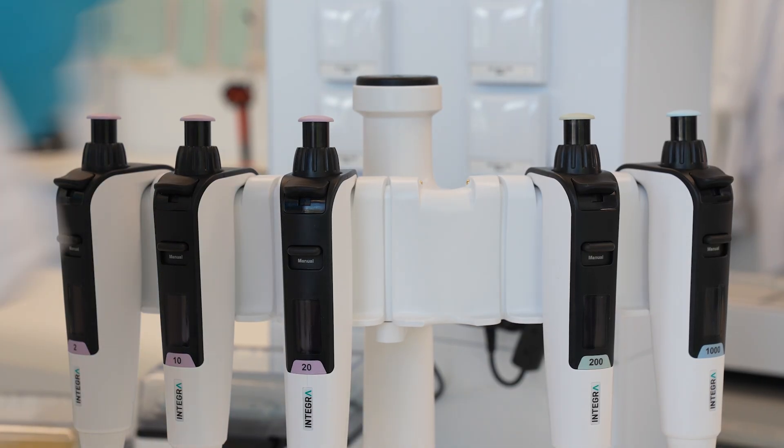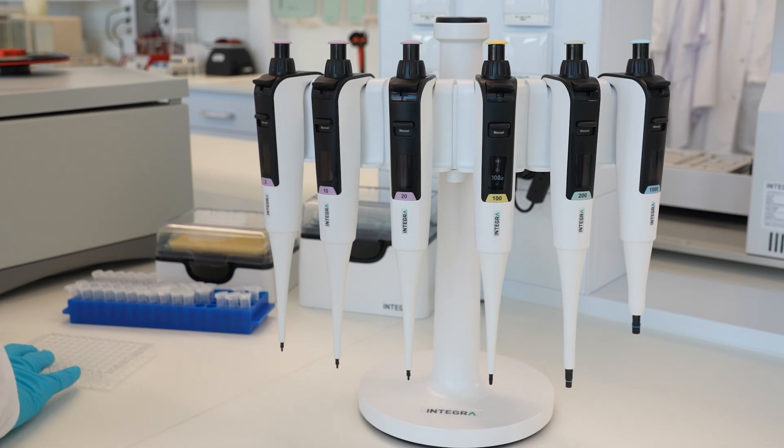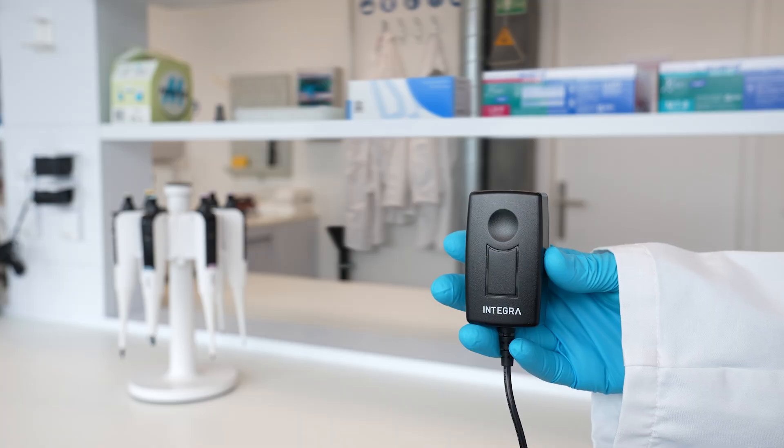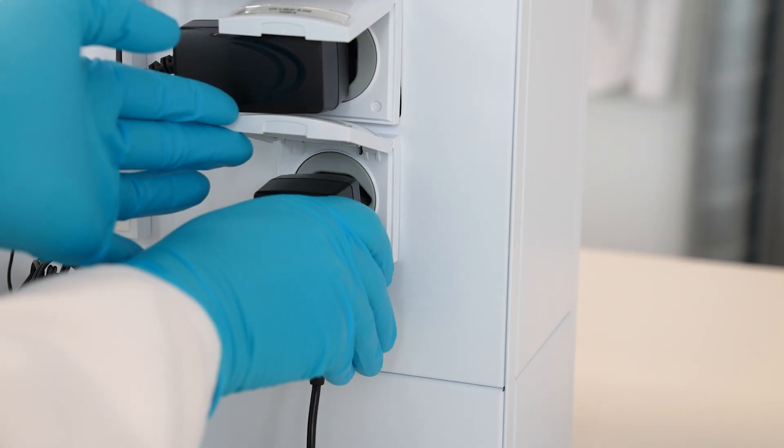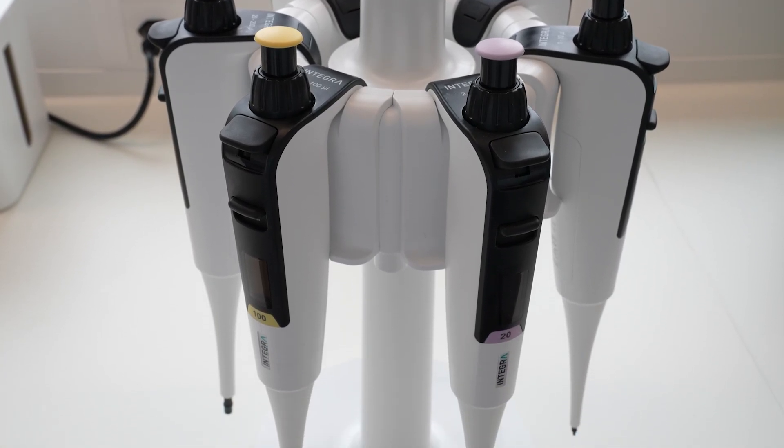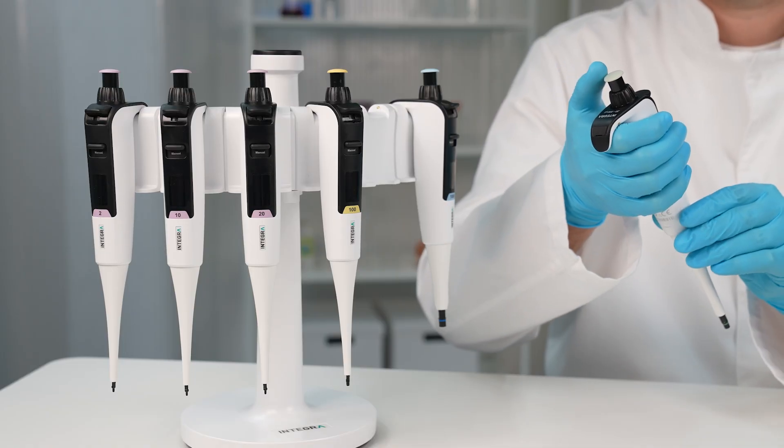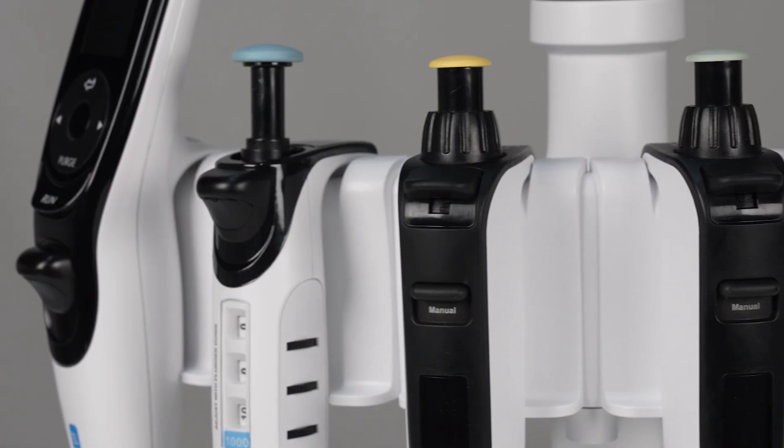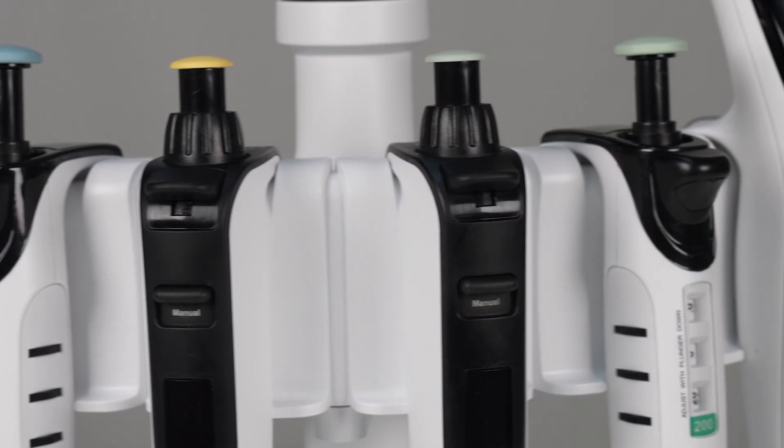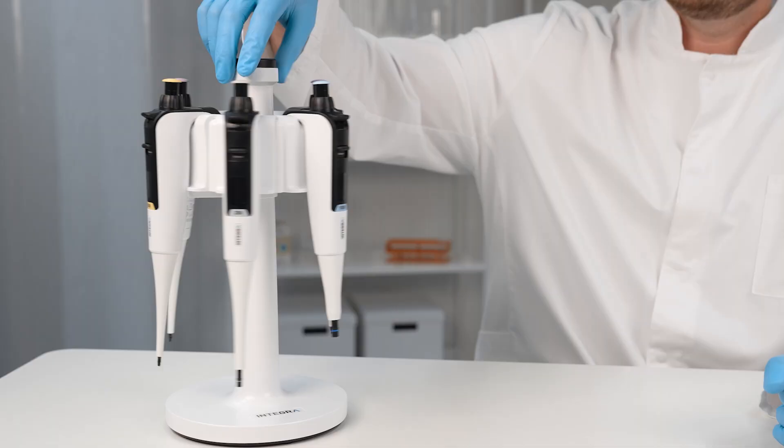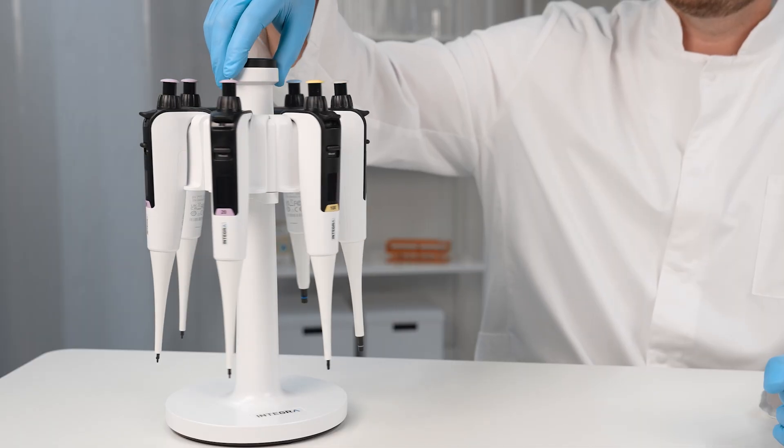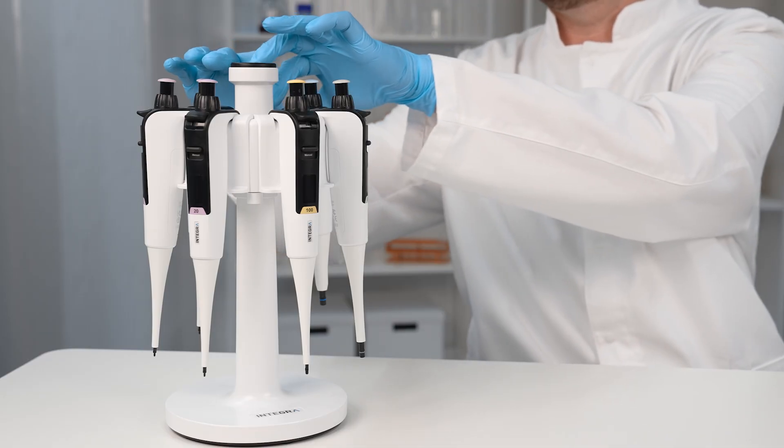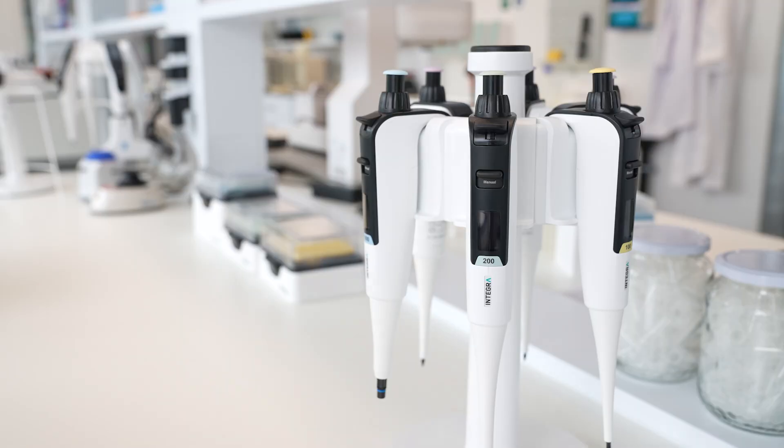When not in use, Switch can be stored on a Flex charging stand. Tidy bench? Check. Charged pipettes? Double check. The versatile and one-of-a-kind Flex charging stand keeps your Switch pipettes organized, charged, and ready for action alongside your other favorite Integra tools. This stand offers complete flexibility in storage—use it as a rotary stand or simply open it up and use a linear stand to more easily grab and switch out your pipettes. However you want to work and store your pipettes, the Flex charging stand offers you exactly that flexibility.